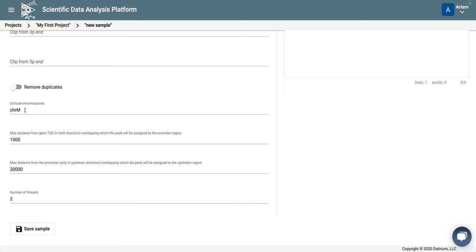But I prefer to exclude reads that fall on chromosome M, because for ATAC we are not very much interested. And oftentimes in ATAC experiments you get a lot of reads from chromosome M. In fact, if you don't want to get many reads, then you should try using Omni ATAC protocol. It works much better than the standard.